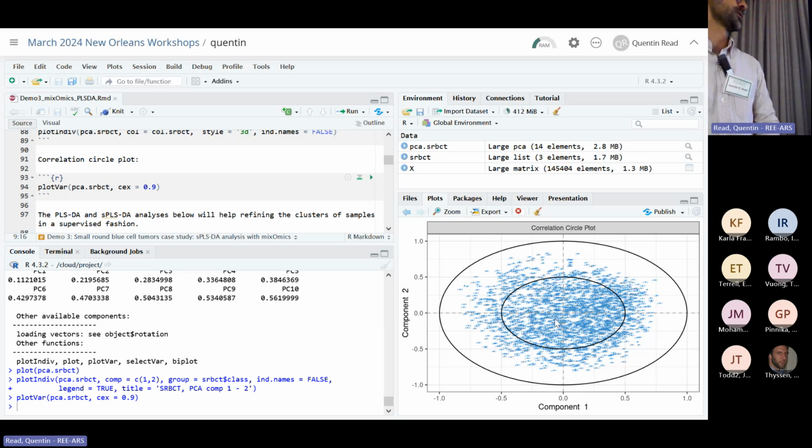If you're close to the origin, 0, 0, you're not very correlated with either of the top two. The genes that are highly associated with the PCs that explain 11 or so % of the variation each are the ones out here. It looks like a shotgun type of thing: you have a lot that are very low and a few high.